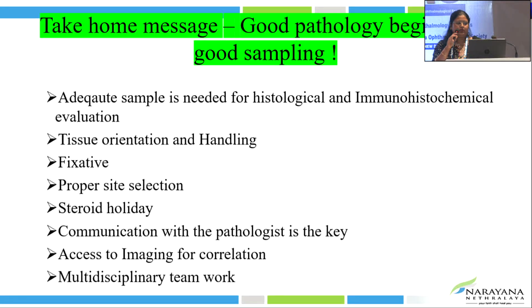And the sampling starts from you. So the good report is in your hands. How well you orient the tissue, how well you handle the tissue. If you're handling the tissue quite roughly with a serrated forceps, that itself gives a lot of crush artifacts that makes it difficult for us to interpret. The fixative you use, I already mentioned, never use concentrated. And if you're sending specimens in normal saline, please mention that to us.